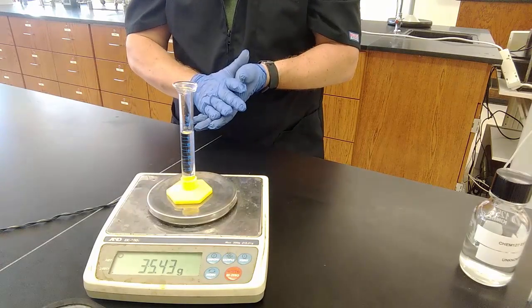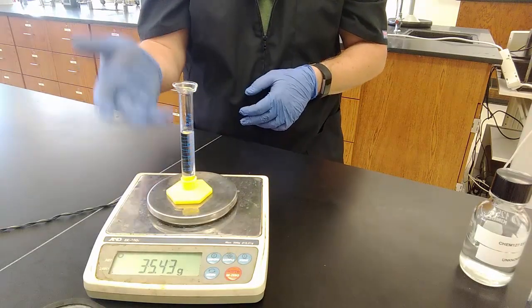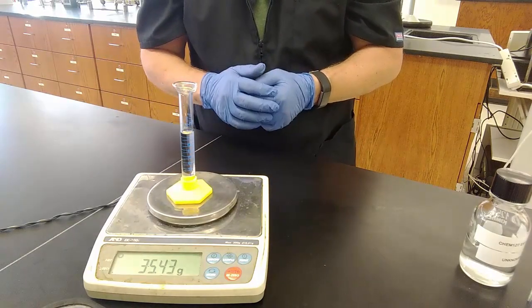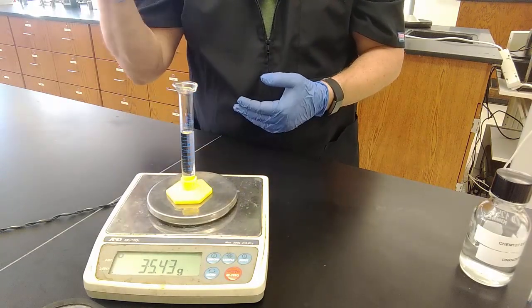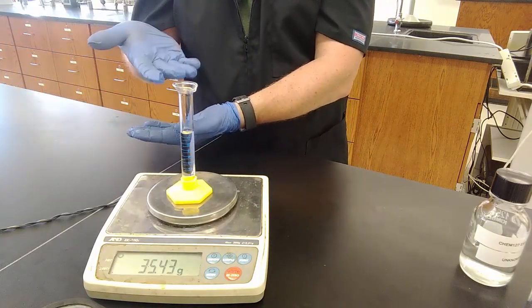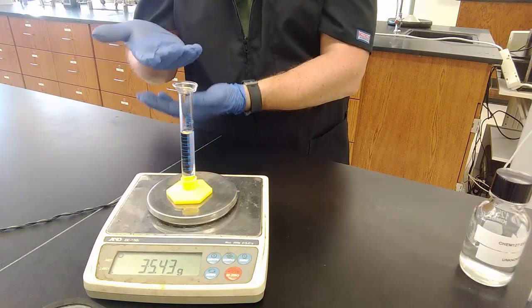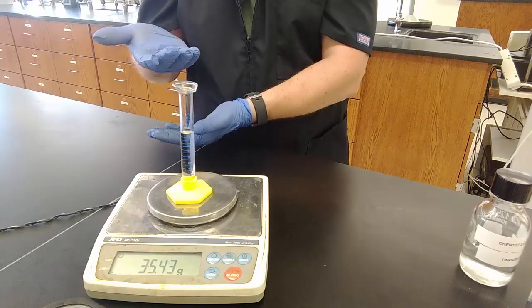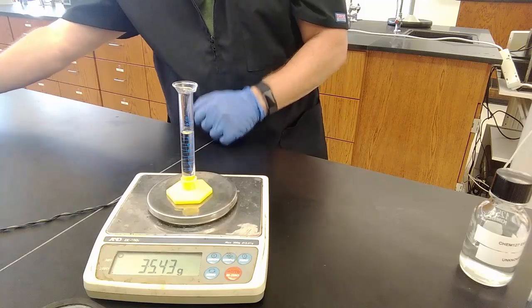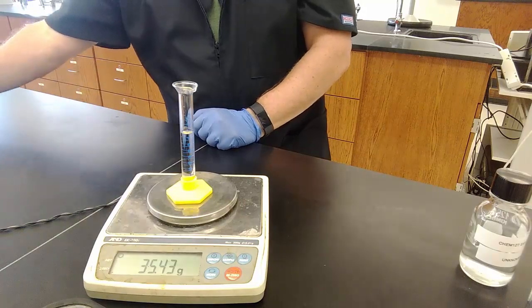So this is good. I have the mass of the graduated cylinder empty, and I can take that away from the mass of the graduated cylinder with the liquid in it. I have the volume of the liquid in it. So once again, I have a number of grams. I have a number of milliliters. Grams per milliliter is the units of density. And so if I just divide grams by milliliters, I will again have a density, and I can flip back to table 1.1 and look at the liquids this time and determine what this liquid is.